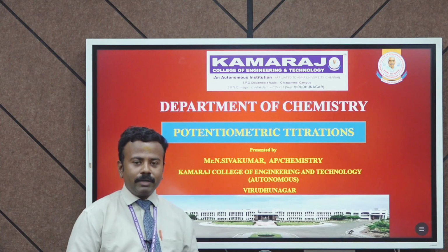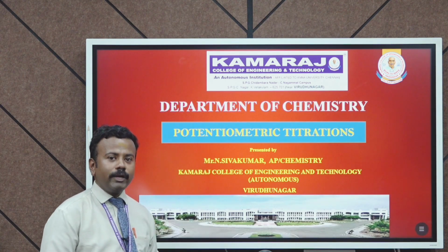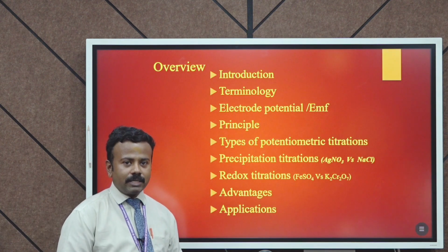In a normal volumetric titration we need an indicator, but in the case of potentiometric titrations no indicators are used. So let's see the overview of the presentation.